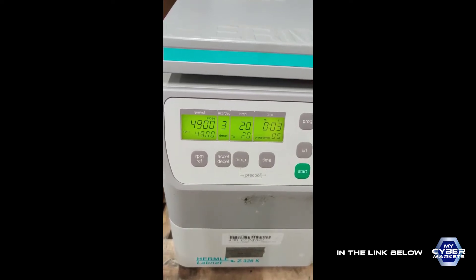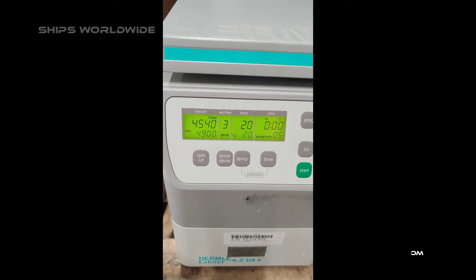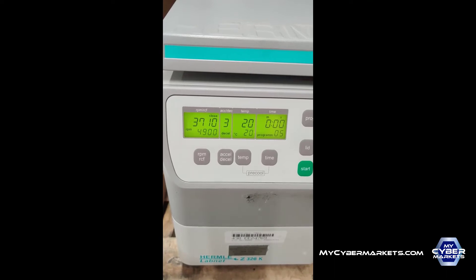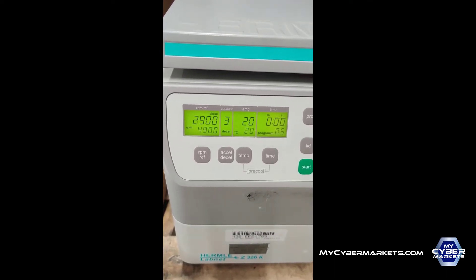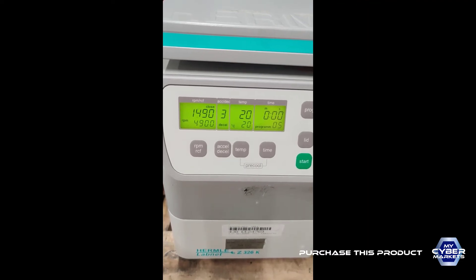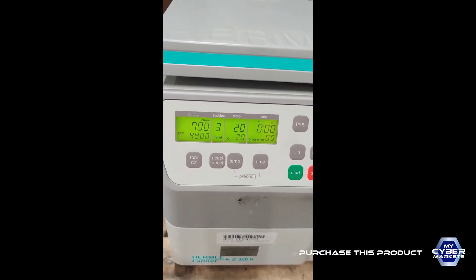Accelerate at 3 — perfect. We have slowed the deceleration time, slow ramp, and it goes to zero perfectly. It cools down very fine.